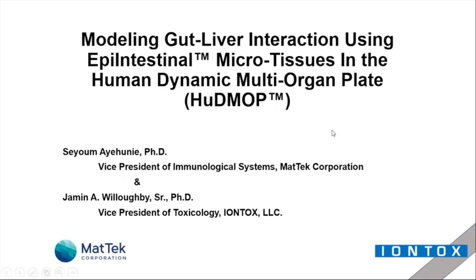Welcome, everybody, to our seminar entitled Modeling Gut-Liver Interaction Using EpiIntestinal Microtissues in a Human Dynamic Multi-Organ Plate, HUDMOP. It's my pleasure to welcome you all to this webinar. My name is Jim McKim. I'm the president of IONTOX. IONTOX is a contract research laboratory that focuses on in vitro models, the application and development of these models, and they're used to understand the safety of drugs and chemicals.